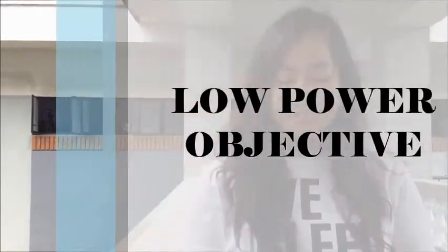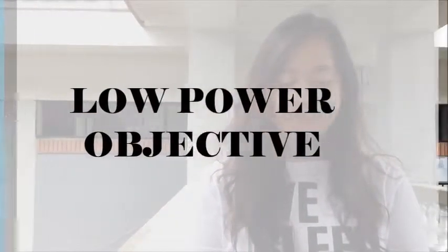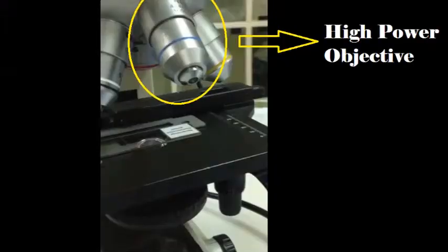Low power objectives. This next shortest objective is probably the most useful lens for viewing slides. Almost any feature you need to observe in this course can be located with the 100 times total magnification this objective provides. As an added benefit, the low power objective is always safe to use as it cannot be lowered to the point of contacting and thus possibly breaking a slide. This is also true of scanning objectives.